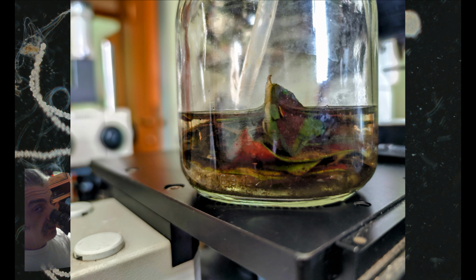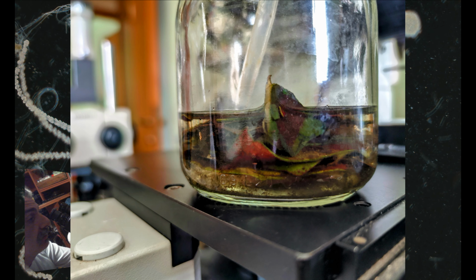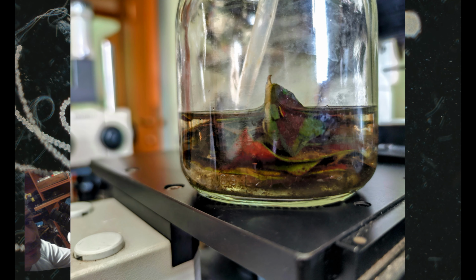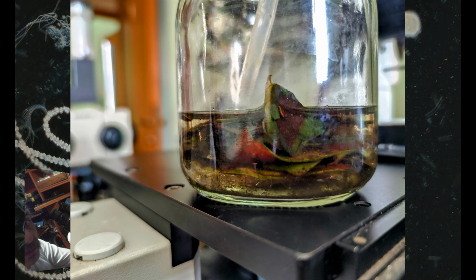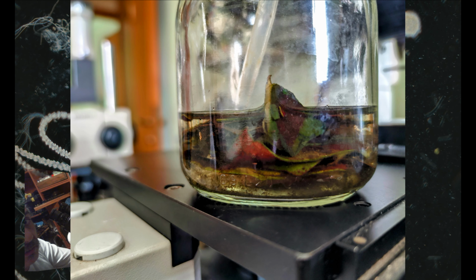Okay, here is a picture of the sample I took. Just some water without a plankton net. I don't like plankton nets because I think I get much more diversity when I take raw water. And with the water, I took some water lily leaves, which house a lot of creatures that we'll see.